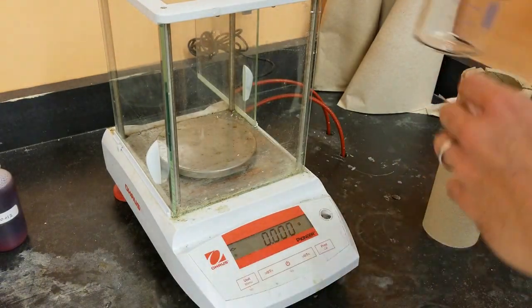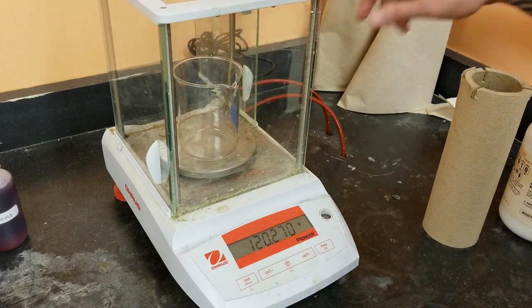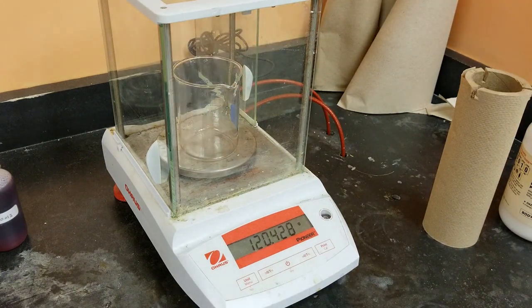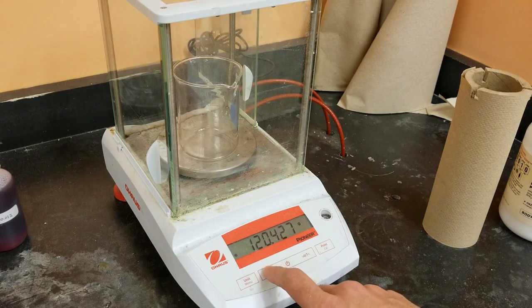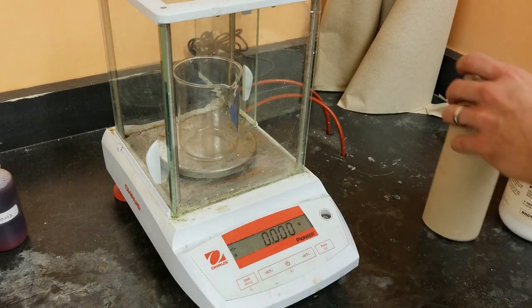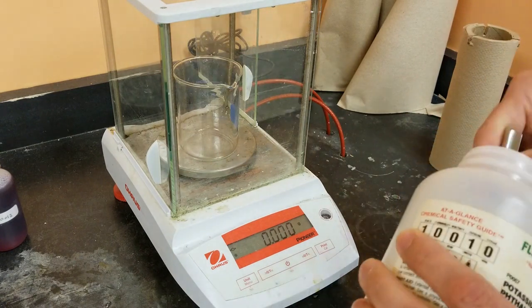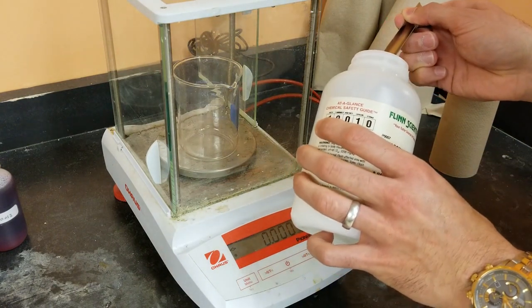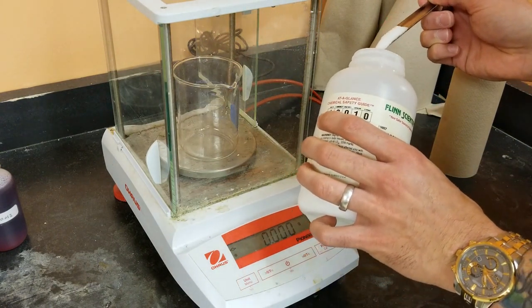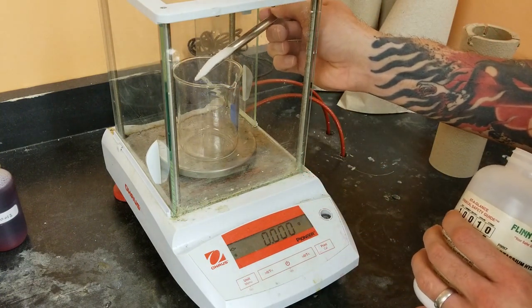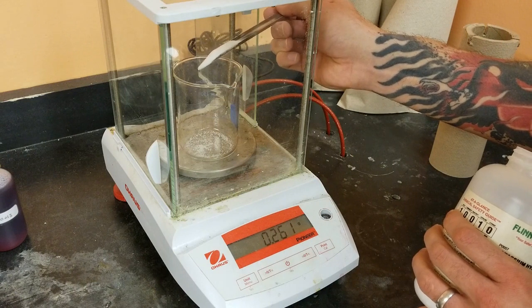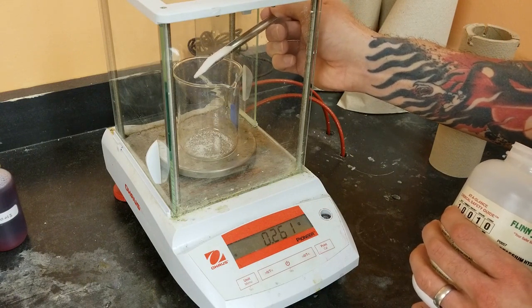I want to weigh out approximately 0.45 grams. It's all right if I'm going to be a little bit over. I'm going to zero out the balance. Now, one typical source of error when you're using KHP is that it is hygroscopic and so it absorbs moisture. So I'm trying to do this quickly.